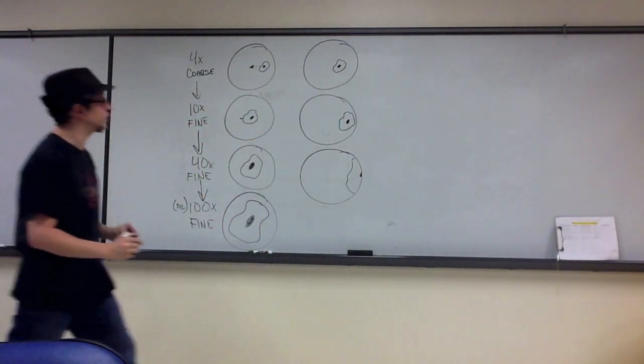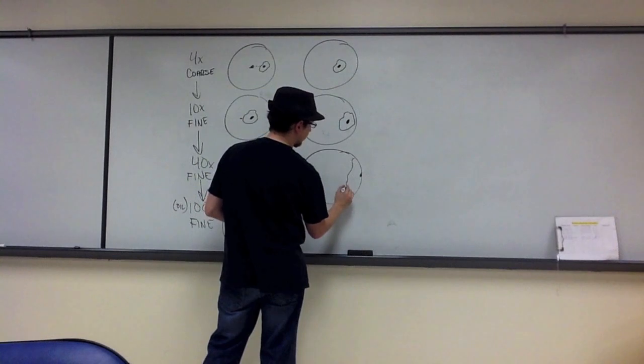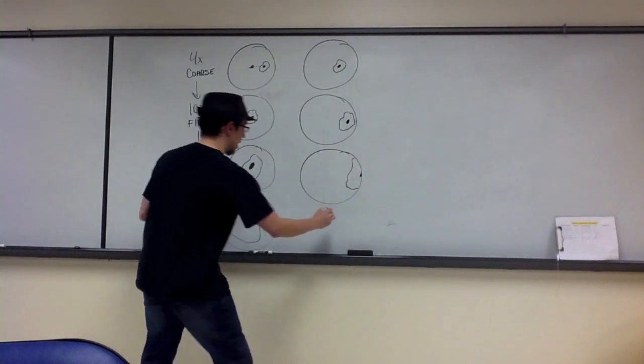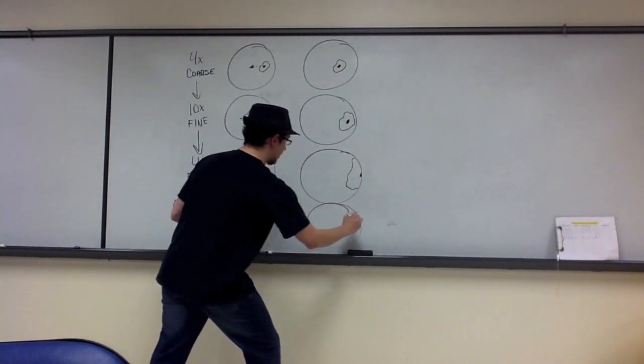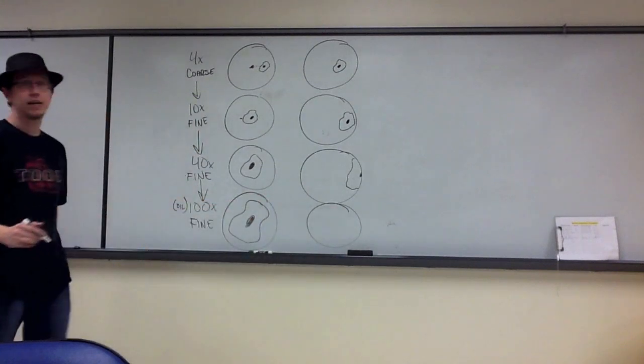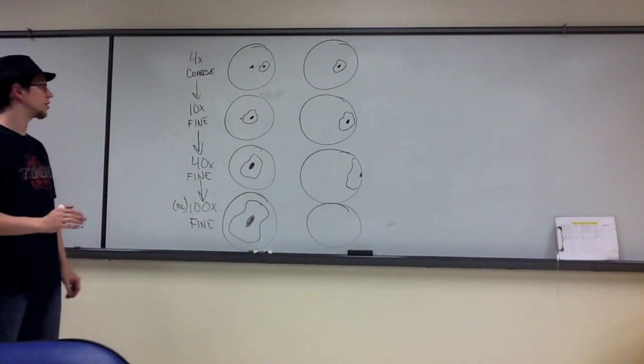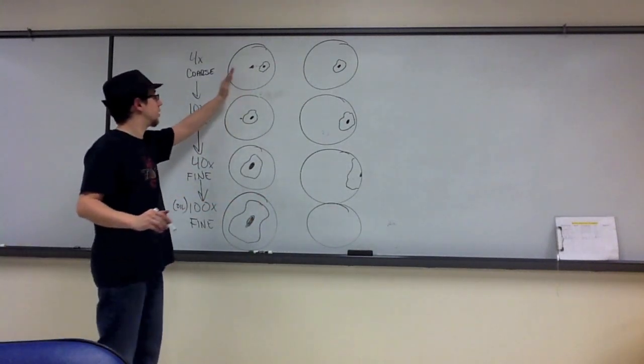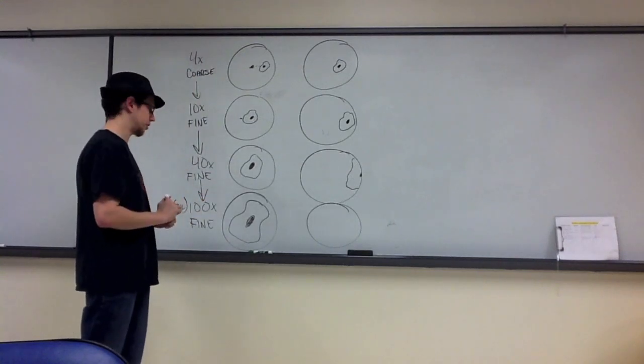I still see that cell to a degree at 40x, but it's off to the side. And then if I took it all the way up to 100x, I might not see any cell at all. This is why it's important to recenter and refocus as you move from objective to objective.